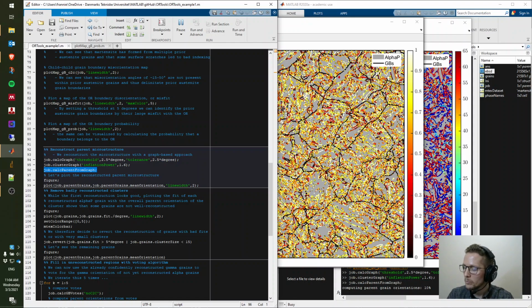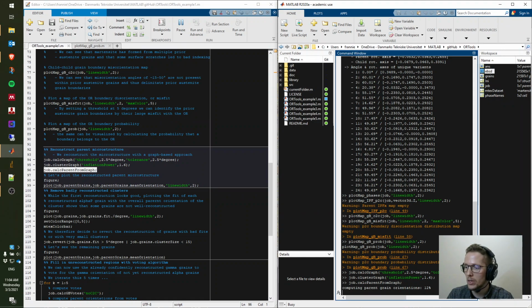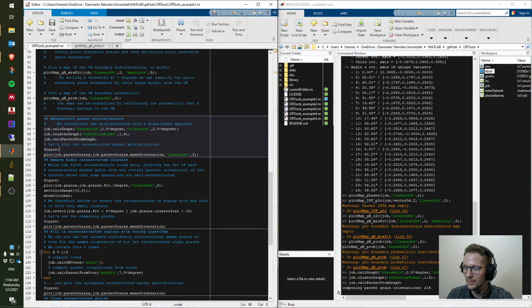This, of course, is a little bit computationally intensive. This will take a little longer. Usually this runs faster, but since I'm recording a video as well, my normal office laptop here is a little bit more under pressure. Just to show what's going to happen next in the meantime.